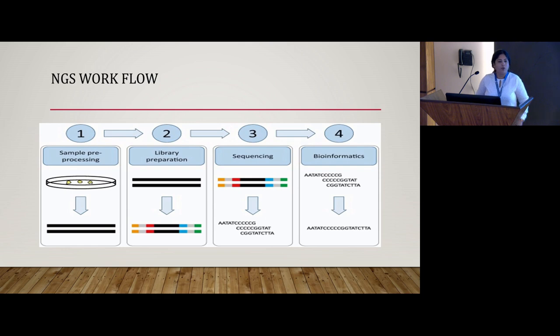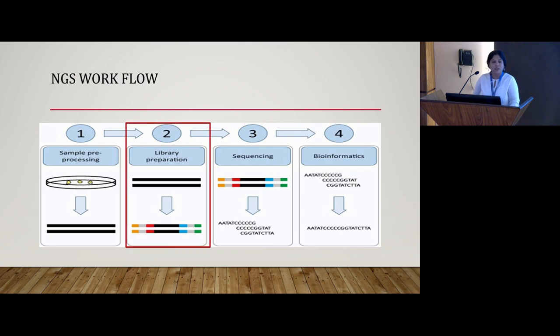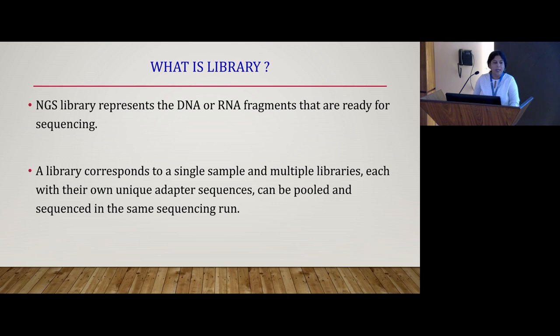The overall workflow of NGS starts with the sample preparation, that is isolation of your nucleic acid, library preparation, sequencing, data analysis and interpretation. Assessing the quality of the library at this stage is crucial because it determines the success of the subsequent sequencing run. So what is library?